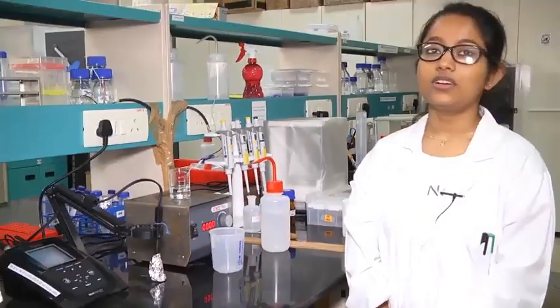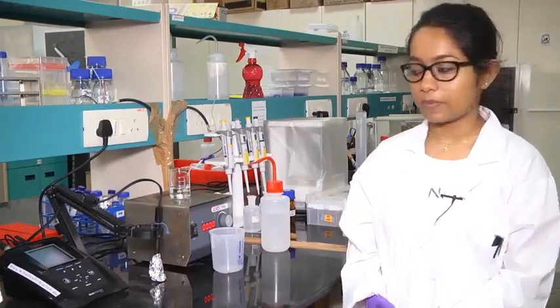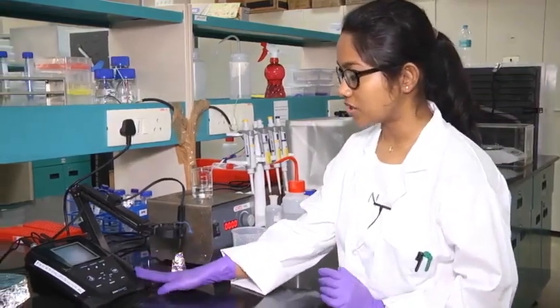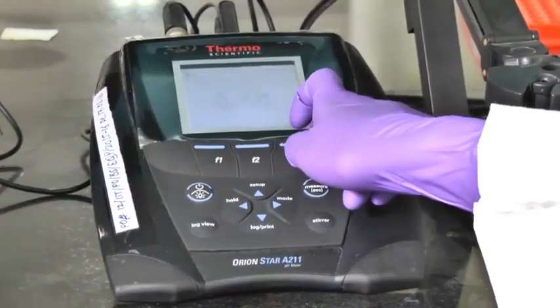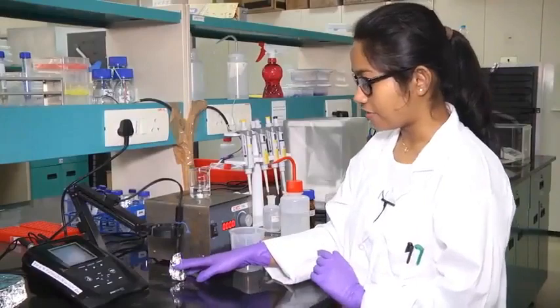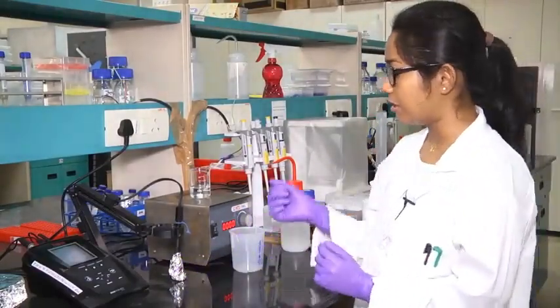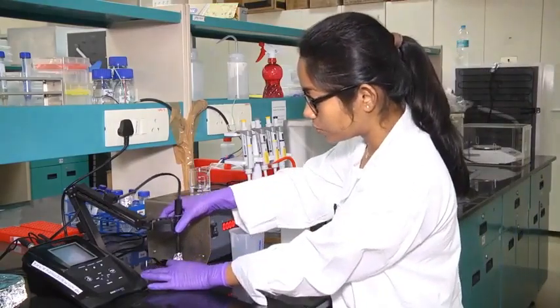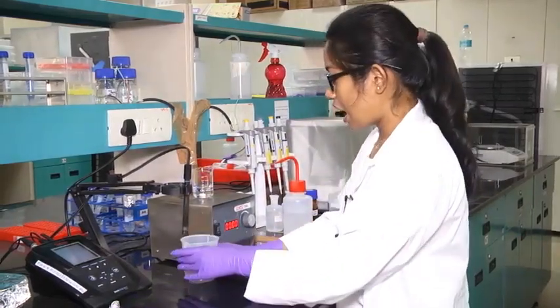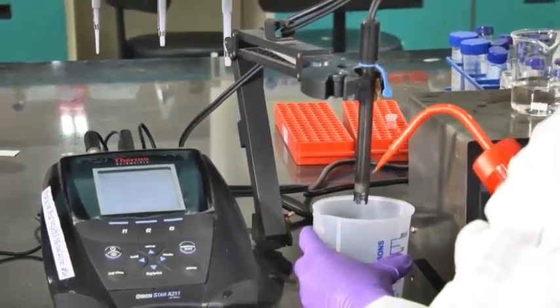Thank you. Hello, today I will show you how to use a pH meter and how to measure the pH of a solution. So for that we have a pH meter here, and in this monitor you can see the pH reading, also the temperature and the volt. And along with the monitor we will have an electrode which has to be cleaned before we start using it. So for that we will remove the electrode from the storing solution which is provided by the manufacturer, and we will clean it with deionized water, rinse it.